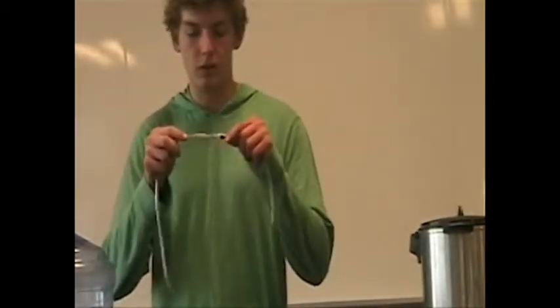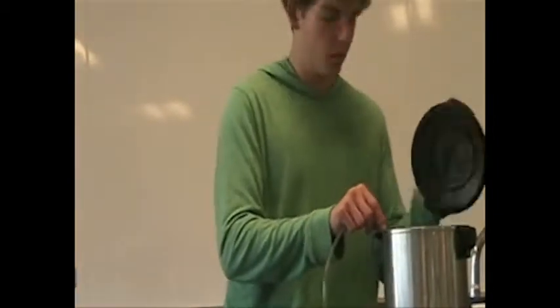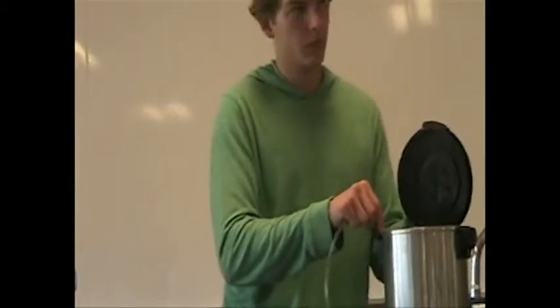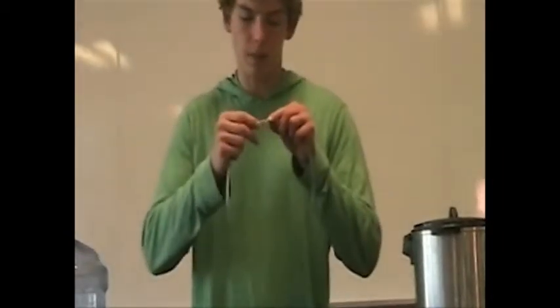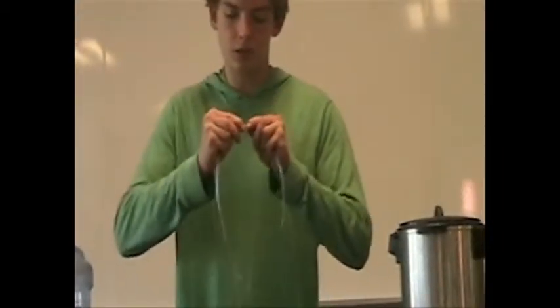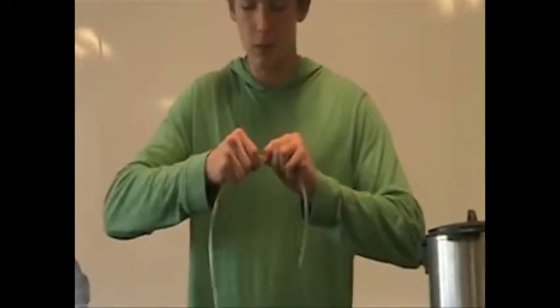That's on there. And do that to the other side. Plenty of tubing. I've got this piece now, pop it on there. This side's longer so that it can reach the actual air pump valve. And it's better for the check valve to be closer to the thing. There's more clean airflow there.